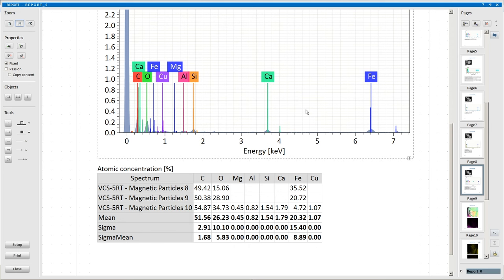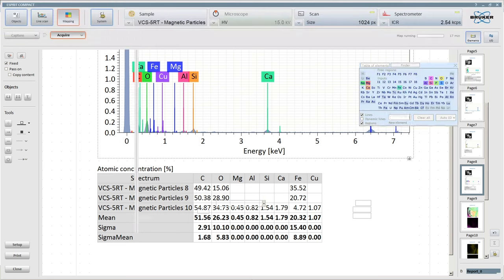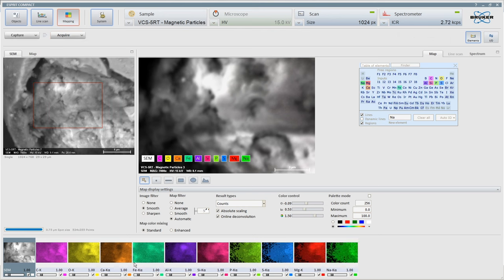So I've got obviously a lot, because out of that bit I got, without much effort, quite a lot of material. So, yeah, it's highly satisfying. Actually, in here, it's got aluminium, silicon, you can see, but it's only in this part. It's diffuse, there's not much data on here. On these ones, they're very low sample rate. And the phosphorus is because the percentage is so low, at the threshold of detection. But it's definitely got silicon, definitely got aluminium. The iron is in the core to a degree, but it could be contamination. But the calcium's everywhere in there. So very, very interesting.